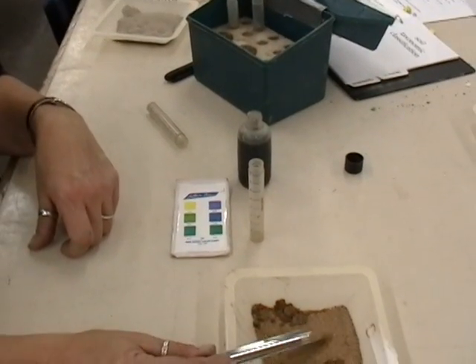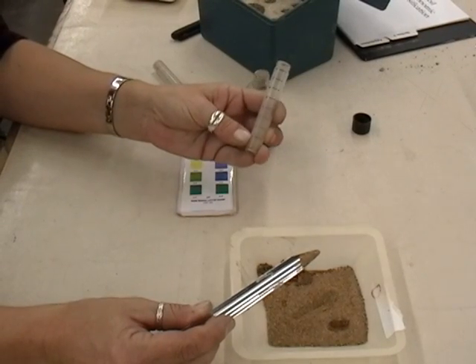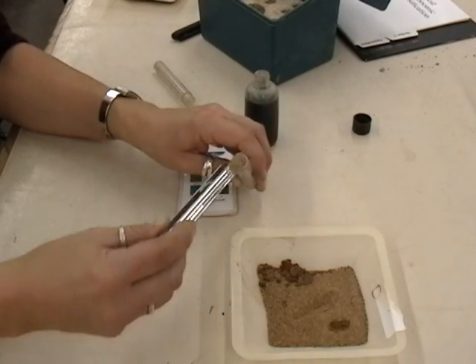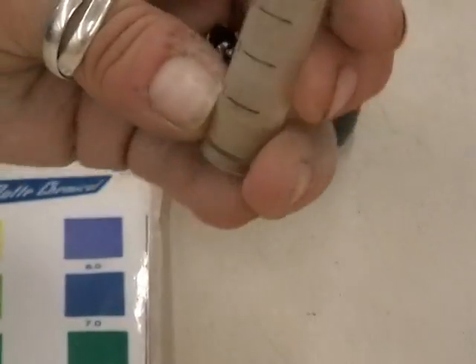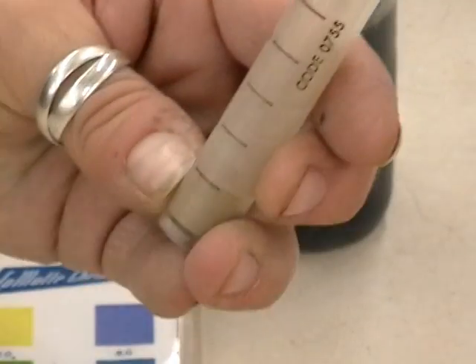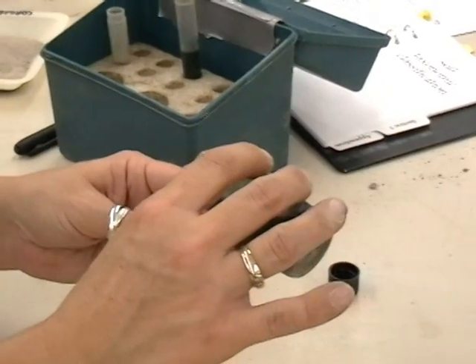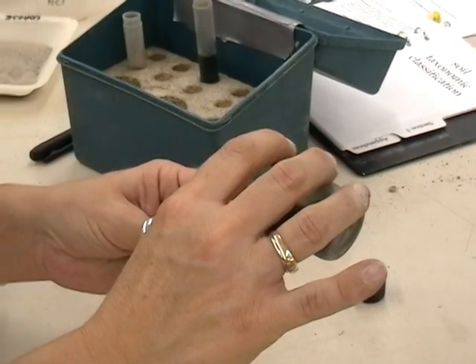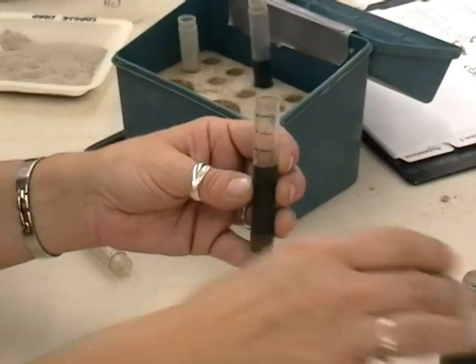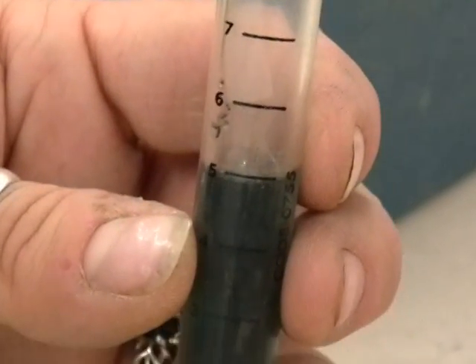Very easy to do. You take your sample from your soil and you're going to fill the vial to the line that's marked number one. So you're looking at maybe about a gram of soil or so, fill to that line, and then you're going to fill to the number five line with the pH indicator solution. The pH indicator solution will encompass the pH on the alkaline scale and also on the acidic scale.